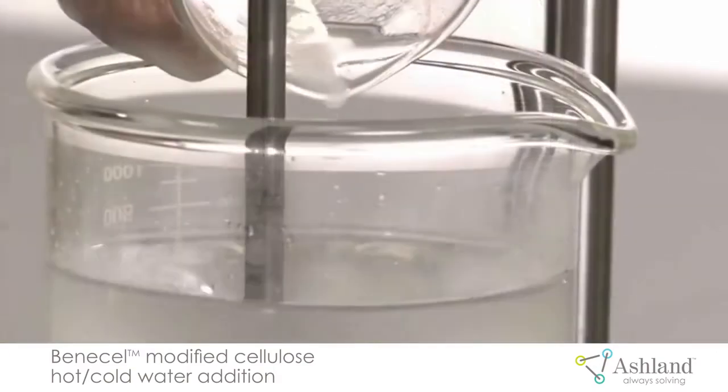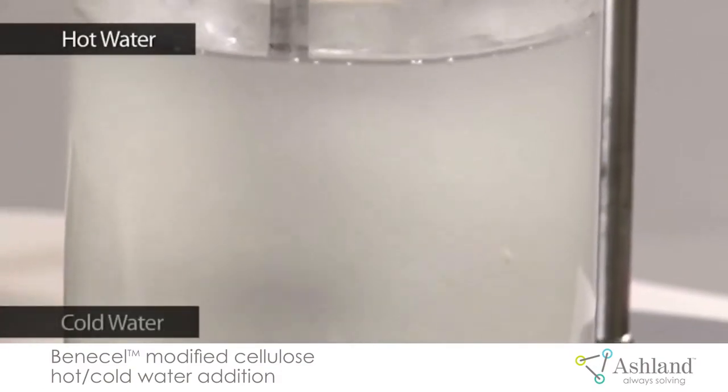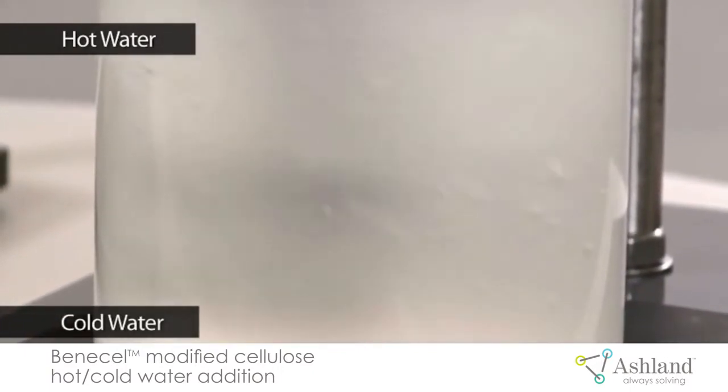When the modified cellulose is added to the balance of cold water, the solution is hazy because it has not yet begun to hydrate. You can let it cool down under mixing or you can place it in an ice bath to cool more quickly.